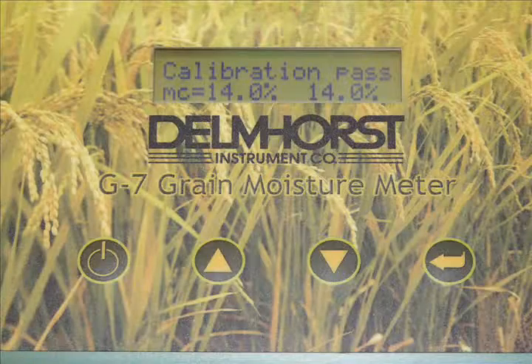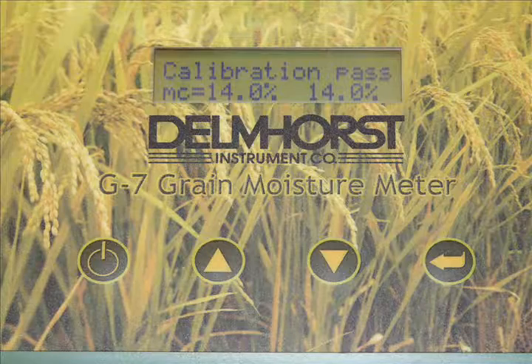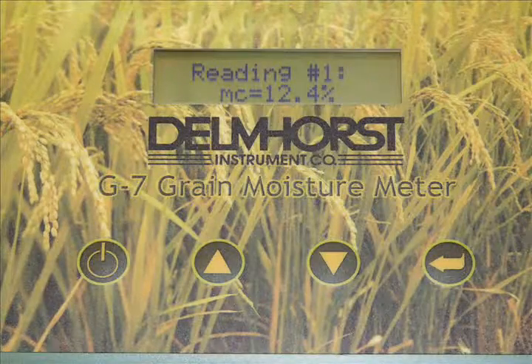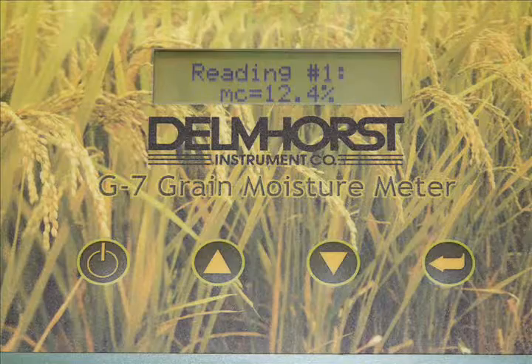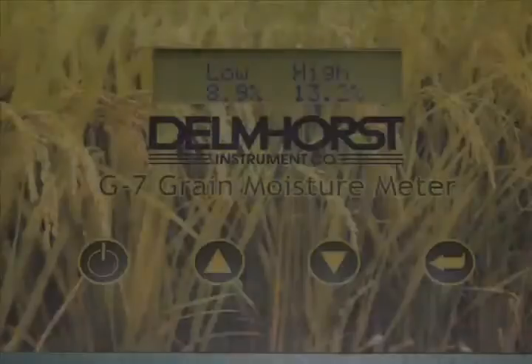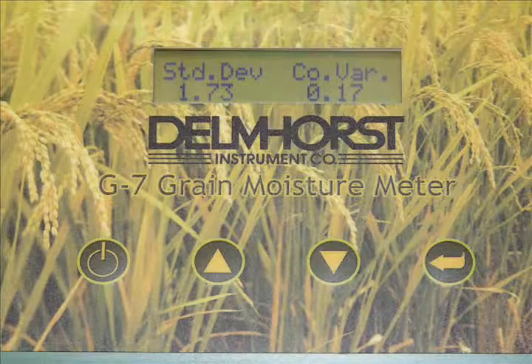A built-in calibration check allows you to verify the accuracy of your readings, and the storage capability will take up to 150 readings in user-defined batches by grain, providing a summary of the number of readings stored, the average of those readings, the highest reading, the standard deviation, and the coefficient of variance.